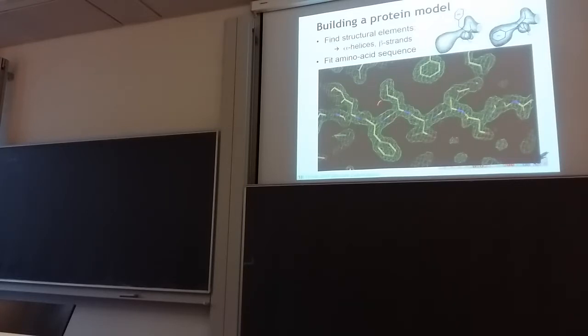If you're resolute, it seems implausible that you get it the wrong way around. But if your resolution isn't so high, then you might have cuts in your backbone, because it's a bit missing. Maybe it was a little bit floppy. So you don't really know where it goes. If you cut it here, then you might think that the backbone goes on here. You might miss that this should be a phenylalanine.